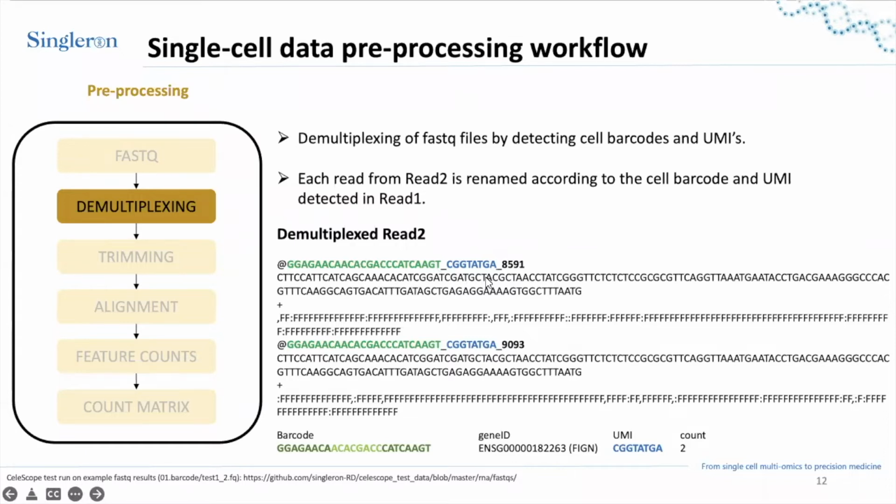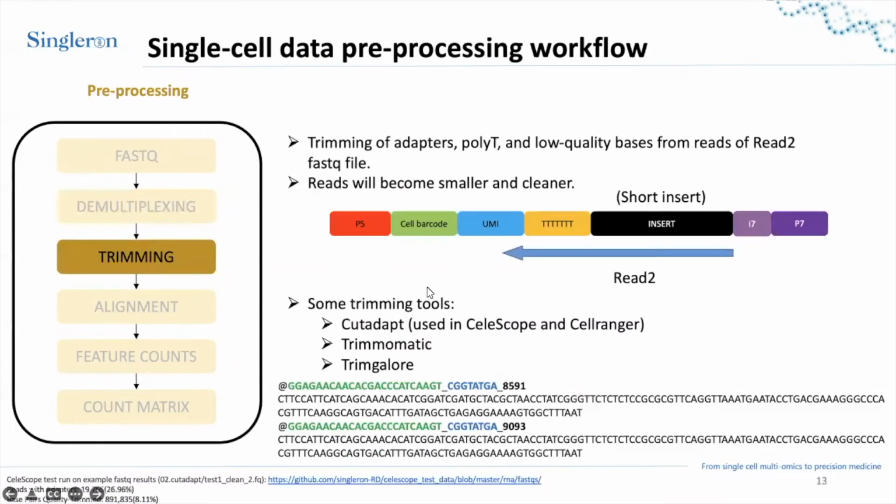Okay, so now we obtained the reads from the true insert sequence, and then the next step will be the trimming. So the trimming will remove any adapters that potentially still remain at this step, and it will trim off the poly-T tails.